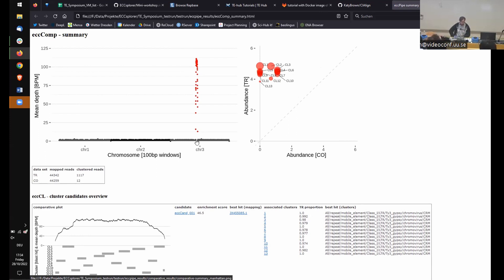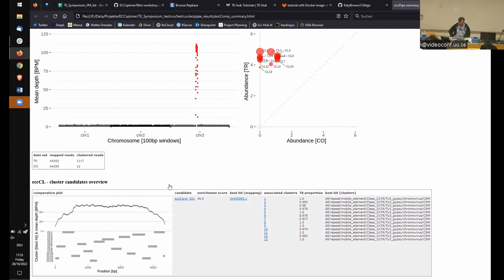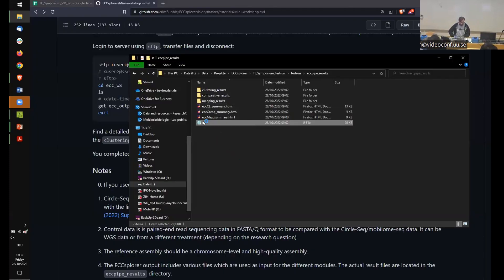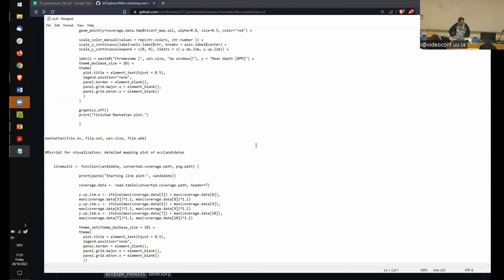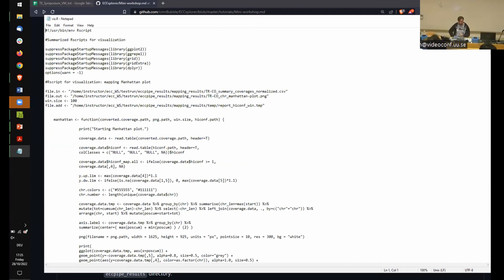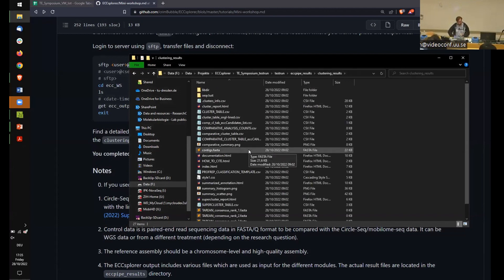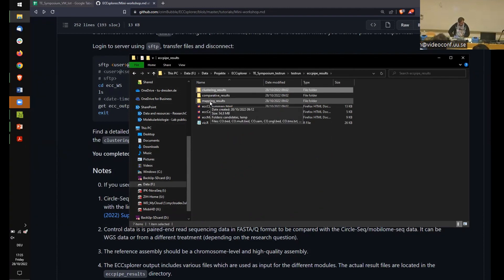Further down you'll see detailed candidate views — for example 'eccDNA candidate 1' — showing a more detailed coverage plot and cluster sequences aligned against the genomic region, with the whole region covered by clusters. There's also an R script so if you know R you can modify every output plot — change colors, adjust for publication, whatever you need. The manual explains most output files, and for clustering you can also consult the RepeatExplorer documentation. Thank you for your attention.